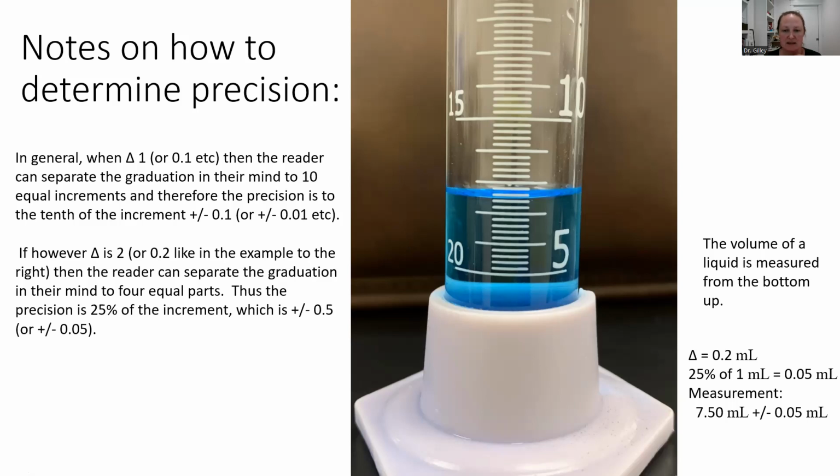So let's look at this volume. We can see that there's a line here at 5, another big line here at 10, and then we have these other lines at 6 milliliters, 7 milliliters, 8 milliliters, 9 milliliters. In between these, say between 7 and 8 milliliters, there are additional hash marks, but we're not breaking it down into 0.1.